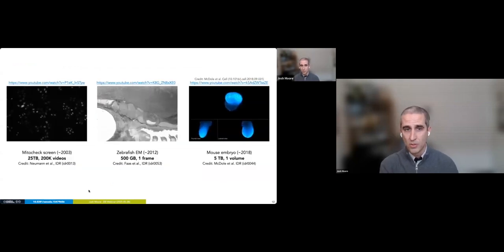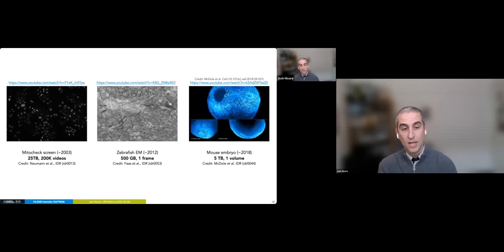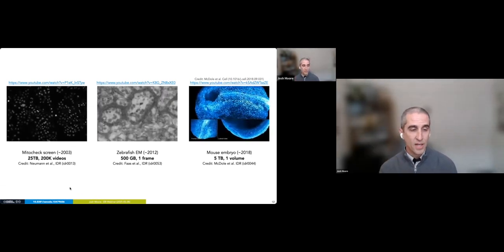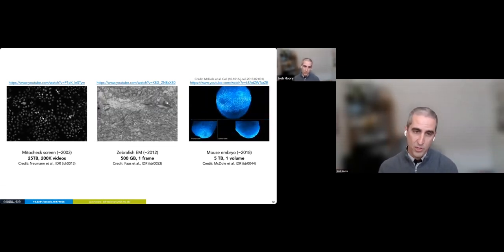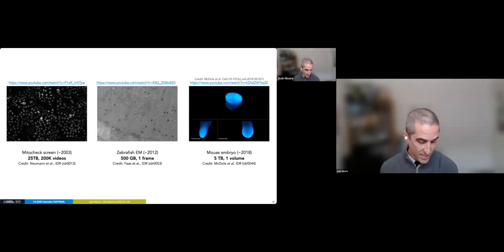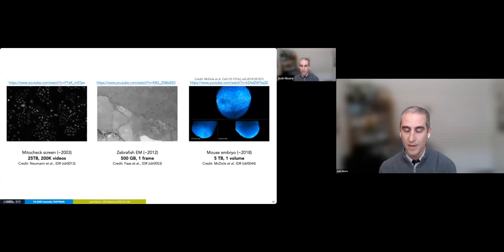So what led me to build OMERO originally was something called the MitoCheck project. It was a collaboration between my lab at the German Cancer Research Center and EMBL and a few other groups. Fundamentally, they were knocking out every gene in the genome and then seeing what happened with mitosis, and took a large number of videos. That led up to 25 terabytes of data, which today is what it is. It's still not easy to work with, but I can tell you in the early 2000s, it was a nightmare. And we fundamentally needed to start building the kind of software that I'm talking about today.